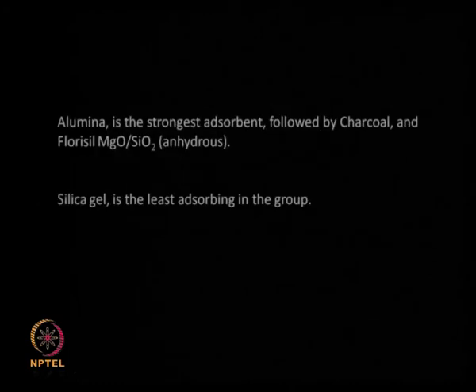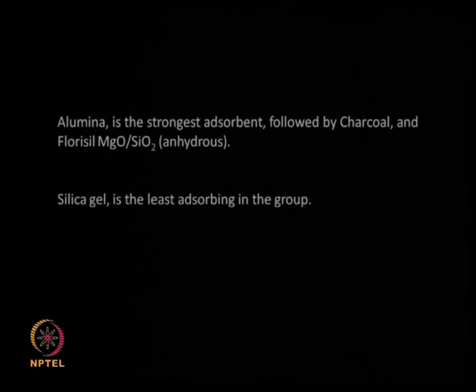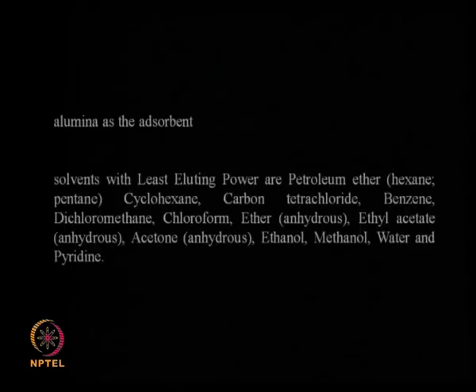So we use alumina, the strongest adsorbent, followed by charcoal, fluorosil, magnesium oxide, silica. We can use silica gel, which is the least adsorbing in the group. So different types of coatings can be used.